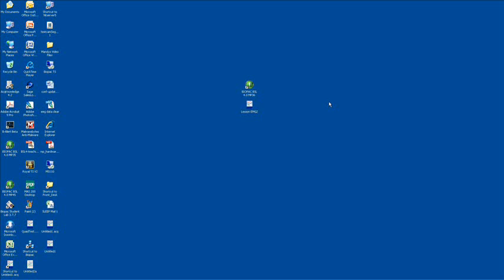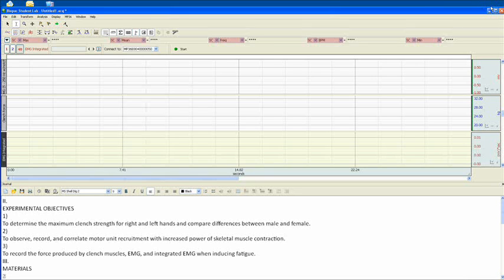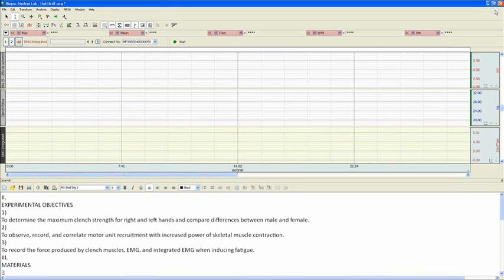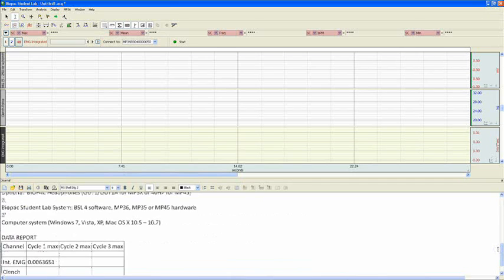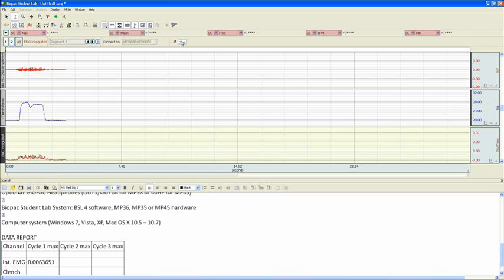To launch the lesson on Lab Day, students simply find it on the desktop. Right here, Lesson EMG2, and double-click. The software will then load our template file. Now, all the students have to do is connect their electrodes, grab their transducer, and follow the instructions you've created to record data. Simply click Start and record that first segment following your lesson protocol.